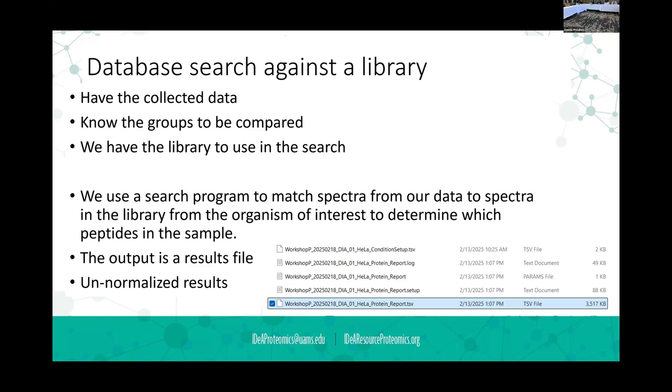And when we do that, I think Kevin did a great job yesterday at lunch talking about some of the different products that he was comparing, like DIA-NN, Spectronaut, Proteome Discoverer and those sorts of things. Those are all different database searching programs. And so that's the starting point for bioinformatics, right?